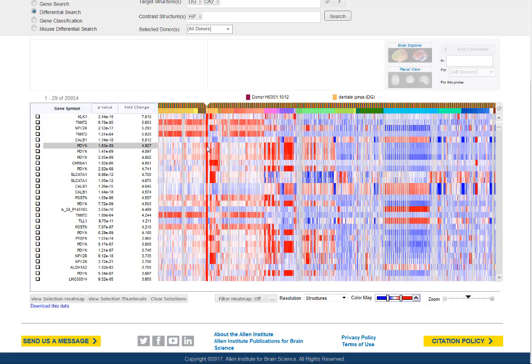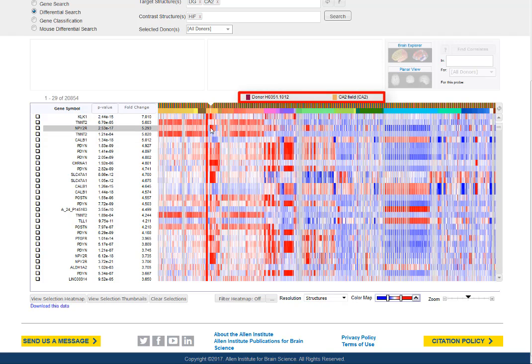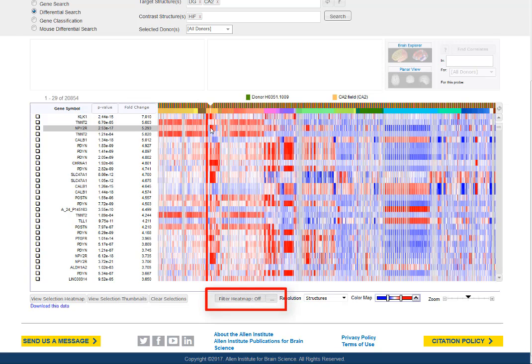Hovering over the heat map allows you to see the donor and structure indicated by the cursor. To be able to better read the heat map, you can constrain the data shown using the filter heat map functions.